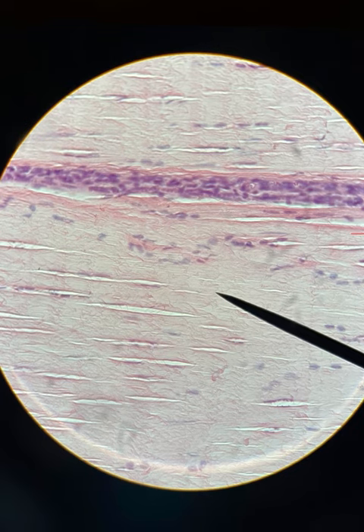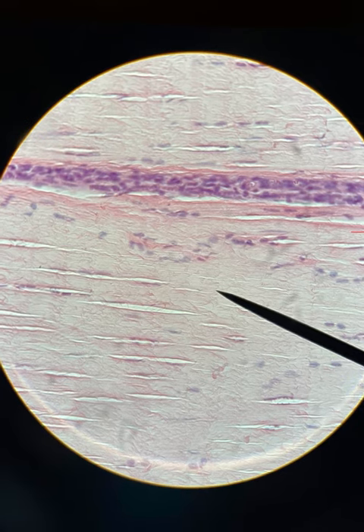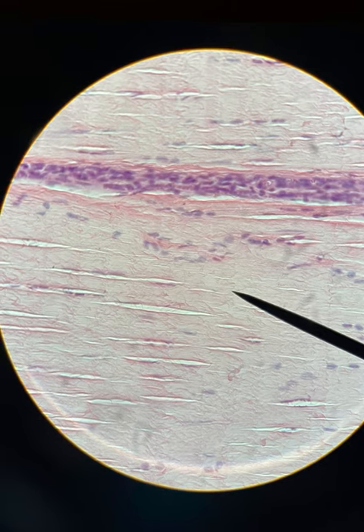And then here we have another type of connective tissue. And this is our dense regular connective tissue. It's also sometimes called dense white fibrous connective tissue. Don't let that throw you off. Dense connective tissue, same thing. Okay, and here you're going to notice that this, as opposed to our irregular dense connective tissue, is just like parallel. It's dense and it's regular. It's not wavy like our dense irregular was.